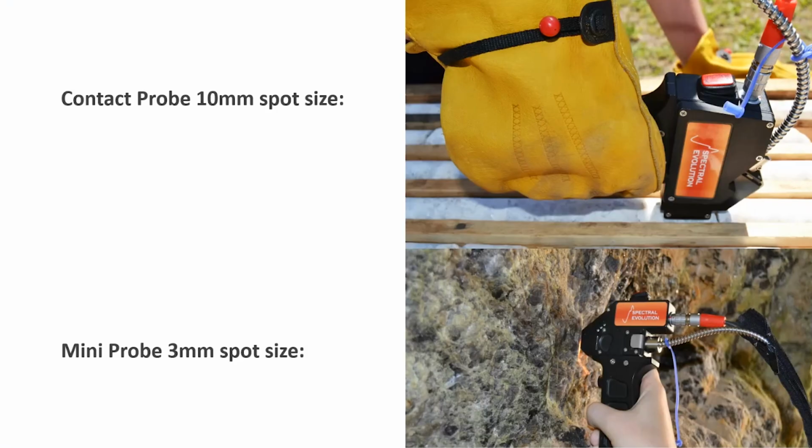So having a high energy light source within a controlled environment allows you to get better mineral spectra. So we have two different options, a 10 millimeter spot size as well as a 3 millimeter spot size to get more targeted on mineral grains.